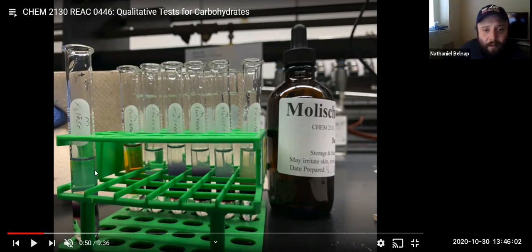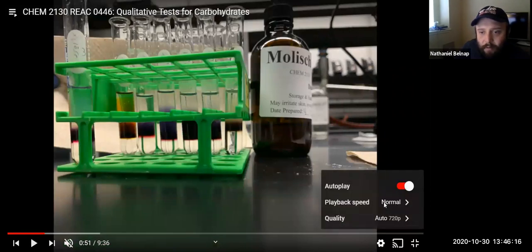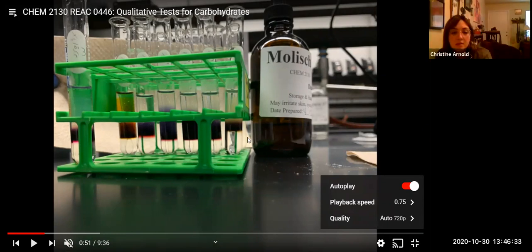So it looks like only sucrose turned to a brown color. And then it looks like fructose might be turning brown. Let's slow this down. This is going too fast. So do you guys see that? And this is for the MOLISCH reagent. So would you say that the one on the very right is positive or negative?